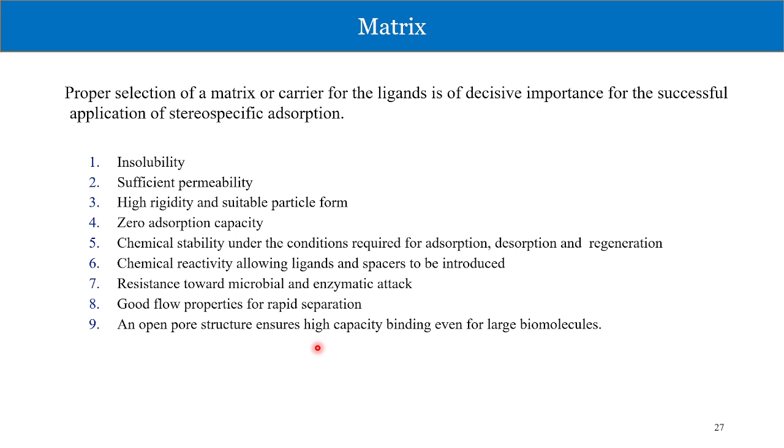It should be highly rigid and have a suitable particle form. It should be chemically stable under the conditions for adsorption, desorption, and regeneration. The chemical reactivity should be high enough to allow ligands and spacers to be introduced.